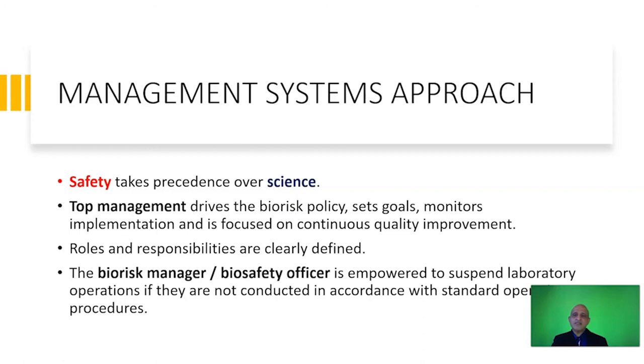And the biorisk manager or the biosafety officer must be empowered to suspend laboratory operations if they are not conducted in accordance with standard operating procedures. So it's a very restrictive system. However, it should be implemented by taking into account the input from all the stakeholders.